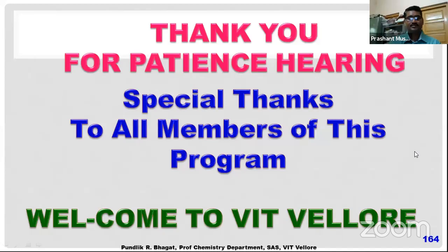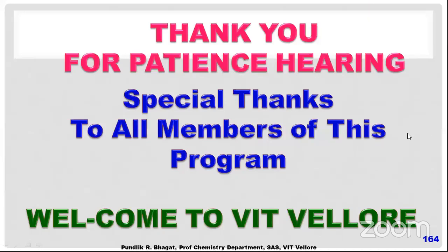Okay, sir. Next question from Chandrakant Nandre. How will you detect hydrogen bonding by IR spectroscopy? It is a very good question.